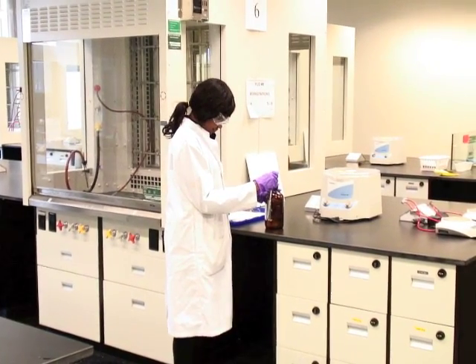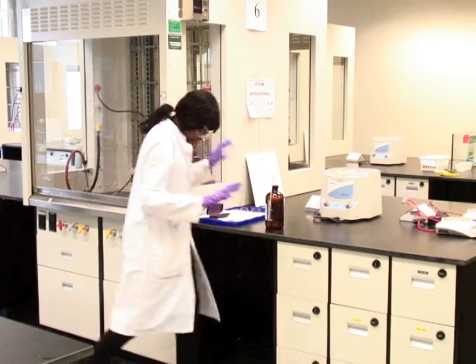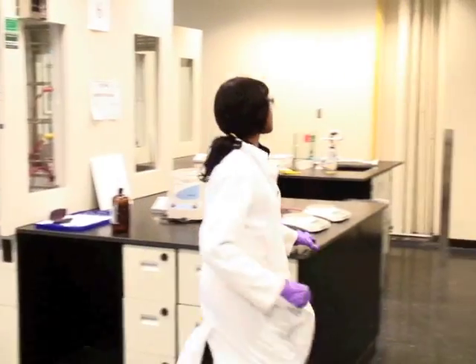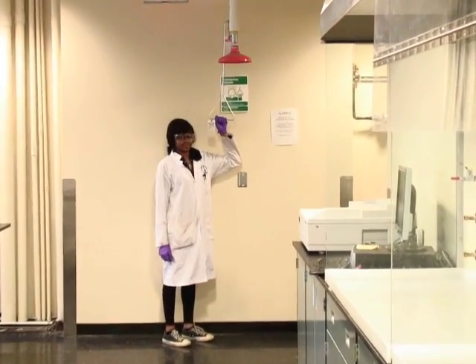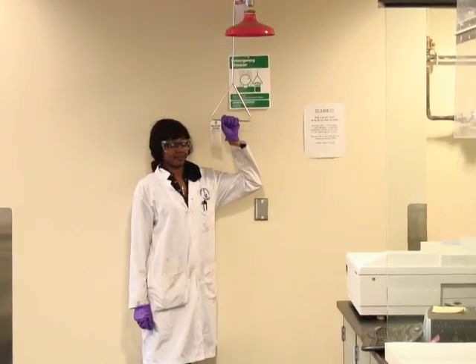If the spill is of a corrosive chemical and there's a large amount on your body, get to a safety shower. Pull the handle and get the affected clothing out of the way. This is not a time for modesty — just pull the garments off.